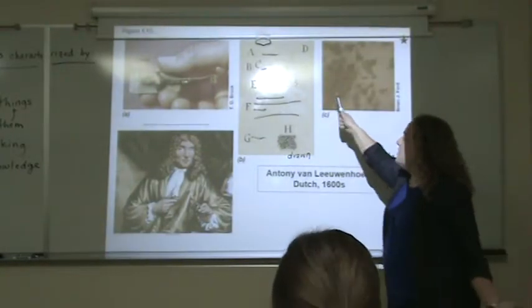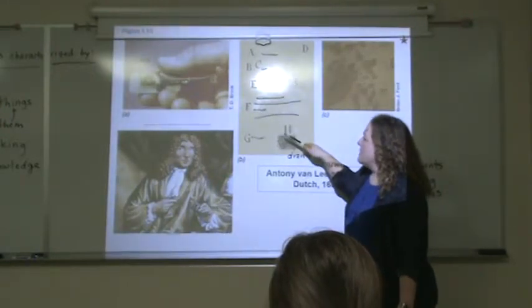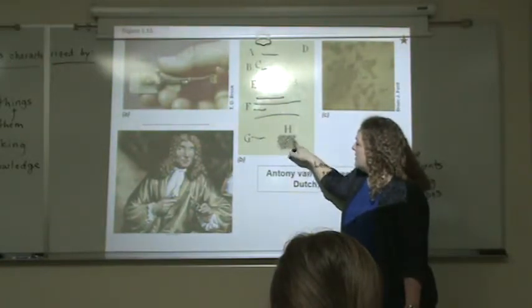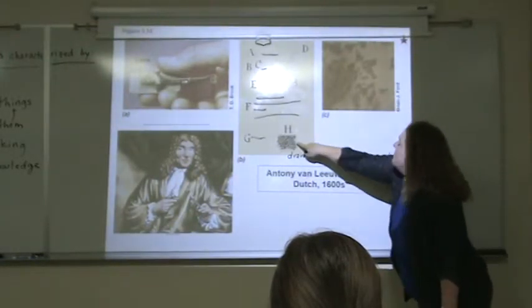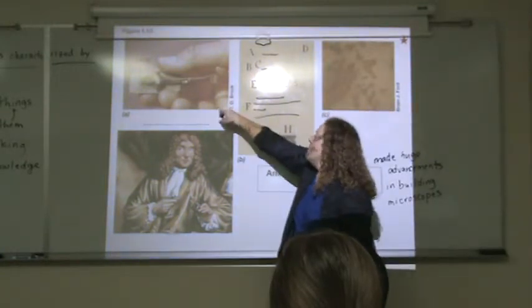So even in this, he's shown there are different shapes of bacteria. They can move. Some of them organize together into groups like this. That's just in one figure that he drew. This is equivalent to this. This is a modern day picture of someone using the microscope.